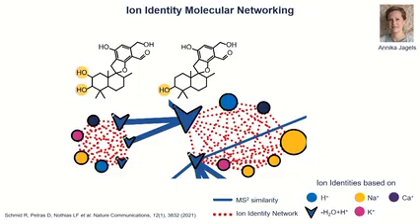Here, for example, on the left side we have one hydroxy group more, and all those arrows are 1 water loss, 2 and 3 water losses, and on the other side, we only have 2 water losses. So if we have 3 water losses, that is also one proof that it might just be another hydroxy group on an aliphatic ring.